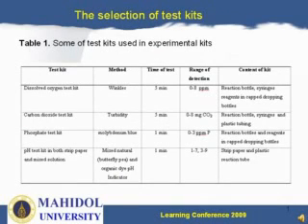The ideas for developing test kits are that they are easy to use, cost-effective for chemicals and equipment, and give hands-on experience for secondary school. Colorimetry by visual color comparison is also widely used.